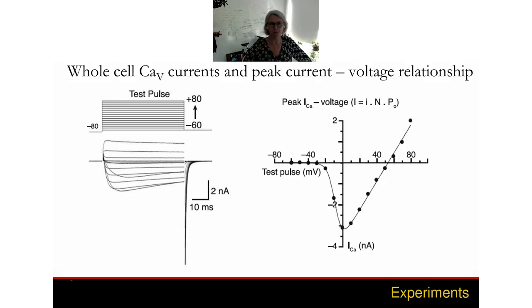I'm going to just run through. These are actually currents that we recorded in my lab, so this is through manual patching, but Alice will show you the data that the students got using the automated patch setup. But I'm just going to run through a couple of the protocols so that Adi and Alice's presentations will be placed in the right context.